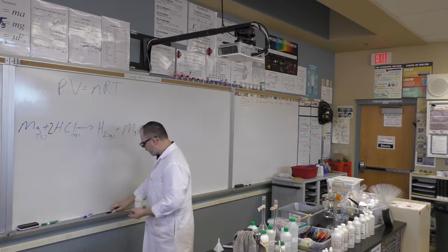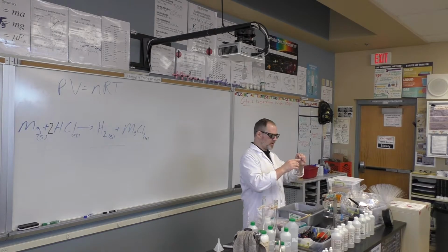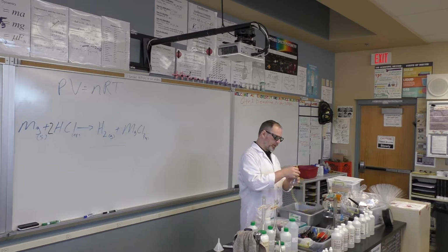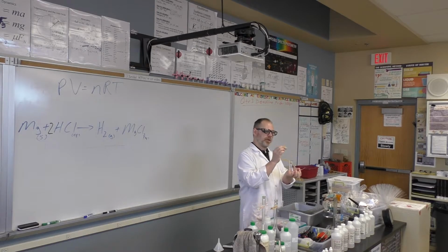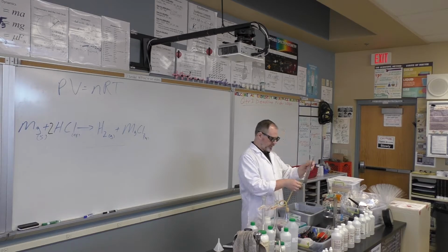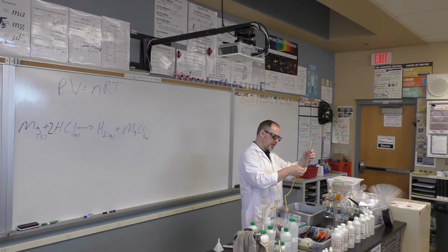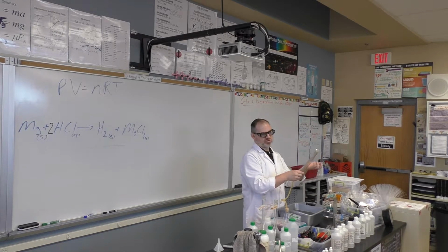Sounds good. So what you're going to do, practically speaking, is put some magnesium into some hydrochloric acid. It's going to produce gas, which we're going to capture in this crazy little gas collection device. We have an Erlenmeyer flask with a 1-hole stopper, and on that stopper is a piece of glass tubing connected to rubber tubing, and the rubber tubing goes under the graduated cylinder in the water. Previously we put the little gas canister under the graduated cylinder; now we're going to put the gas tube under the graduated cylinder, and bubbles are going to be coming up. Make sense? Water displacement again, just like before.